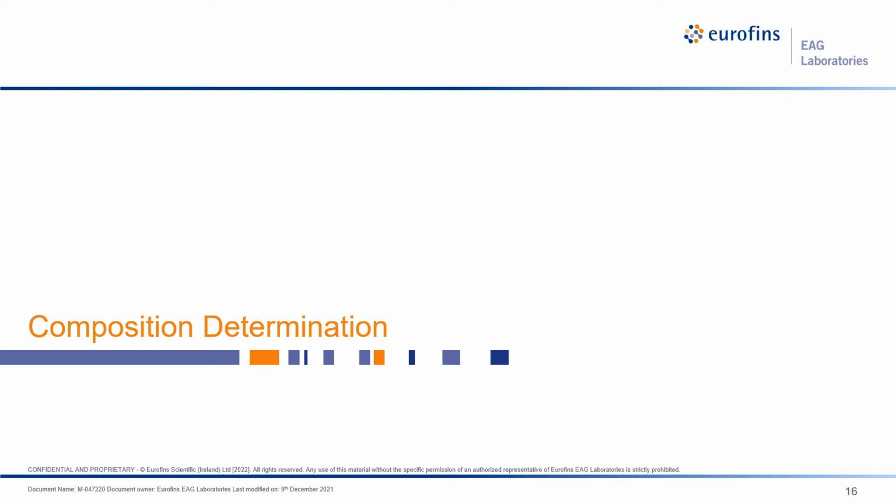And as I was describing before, back 25 years ago when I started doing SIMS, SIMS was not considered to be a technique to use for measuring composition. But over time, because of the demands of our customers and the epitaxial engineers, we looked into developing it.